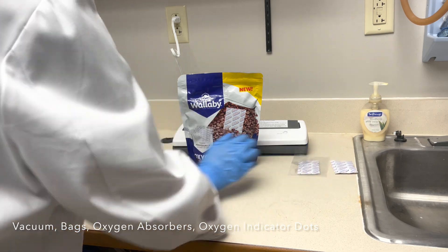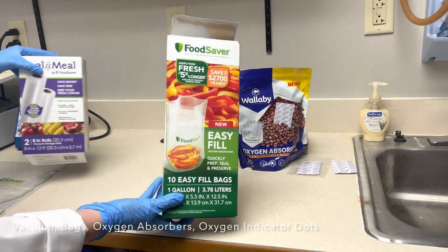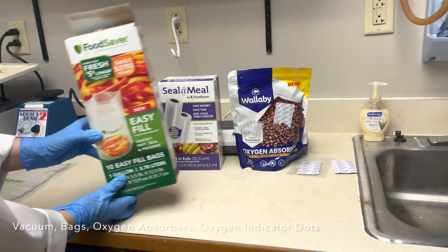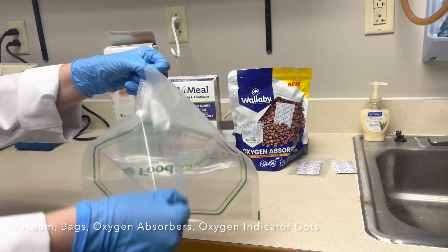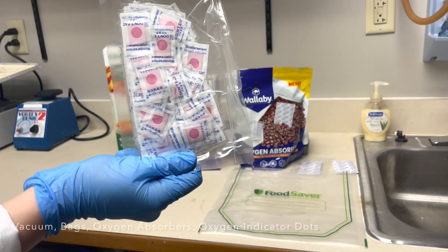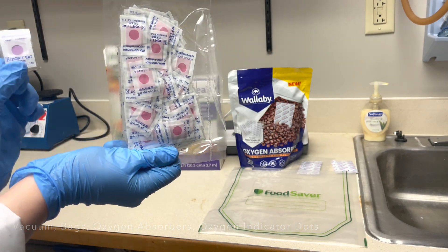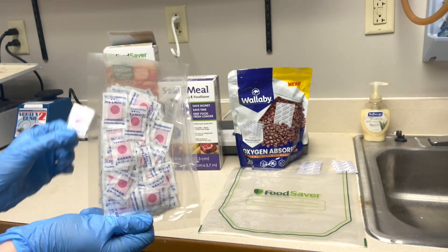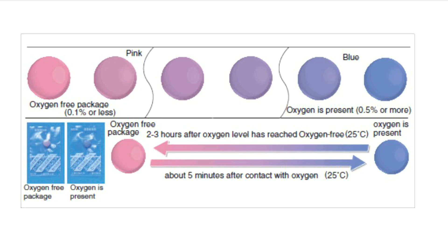These are the vacuum sealable bags designed for the vacuum packer. Some come as individual bags that can be sealed on one side, and some come in rolls to be cut to the desired length and are sealed on both sides. To monitor general oxygen levels we use these oxygen indicator dots. Sometimes they come individually packed and sometimes they come packed in groups. When we are finished we always reseal the bag. Here's a closer look at the mechanism of the oxygen indicator dots — the sealed bag with red dots inside indicates low oxygen, and one outside the bag that was blue indicates oxygen is present. Keep in mind these indicators usually do not change color instantly; for us it took a few hours for them to change to red after they had been vacuum packed, so do not worry if they don't change color instantly.